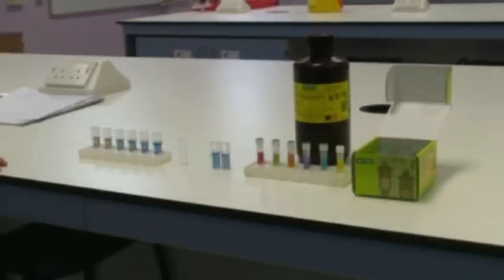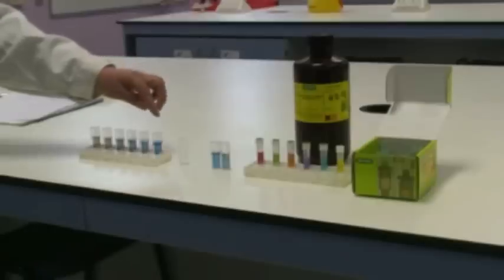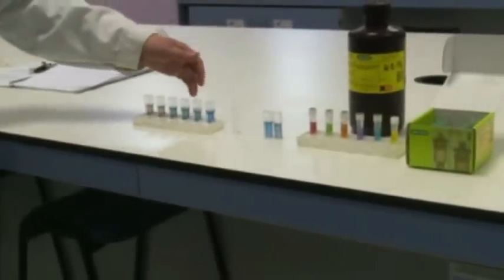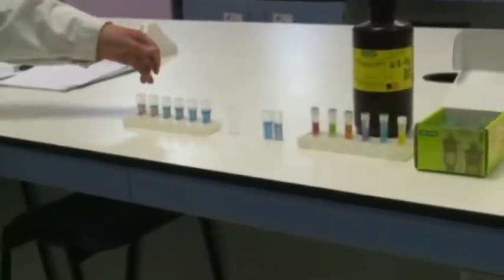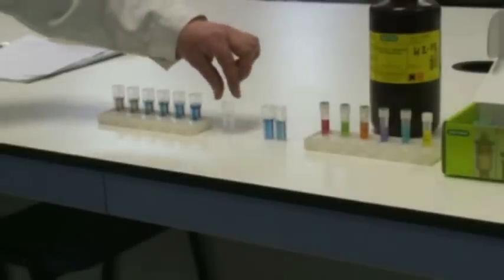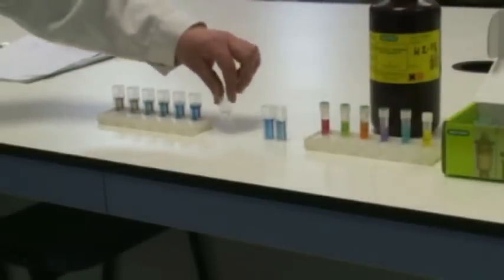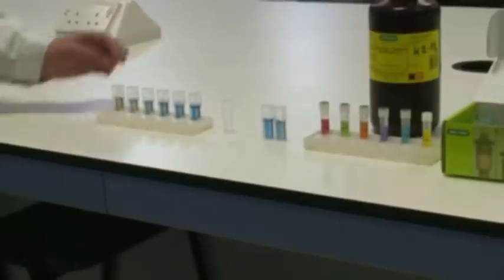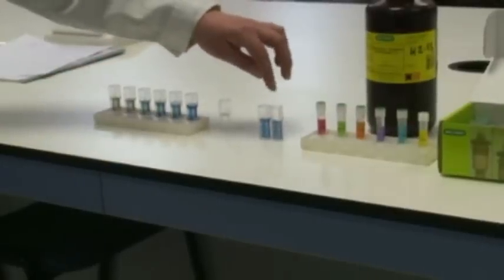You pipette your standards at a range of concentrations and add 1 ml of Bradford Reagent to each cuvette. Here you have your range of standards already prepared to measure with the spectrophotometer. You will also need a blank cuvette with just water to zero your spectrophotometer. And here you have your unknown samples.